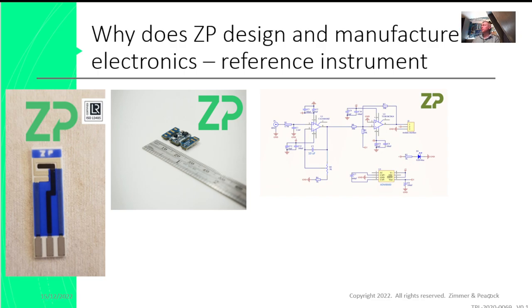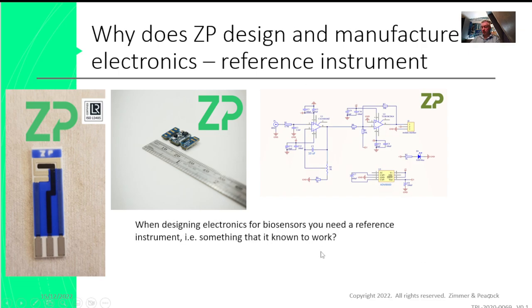It's not the first time that we've had people struggling on the electronics front. There's basically two types. There's people who build their own electronics, and there's people who just use potentiostats. People who use potentiostats generally have no problems, or if they use our electronics, they have no problems. But when you build your own electronics, we do have a few problems.